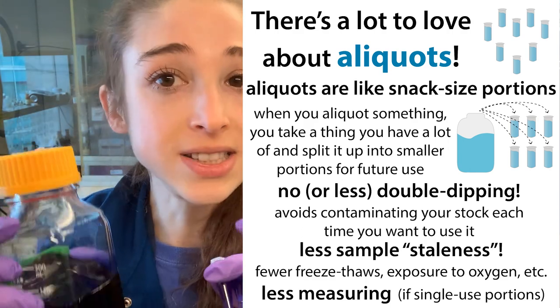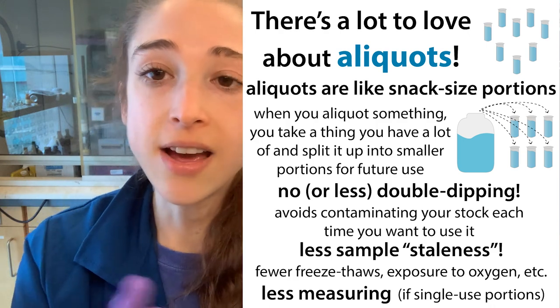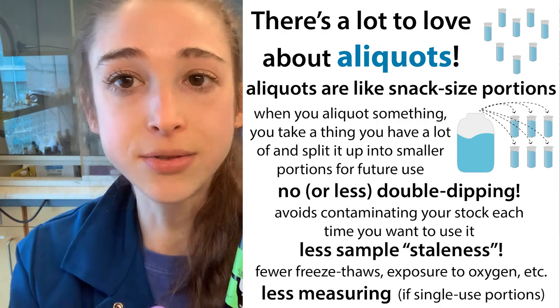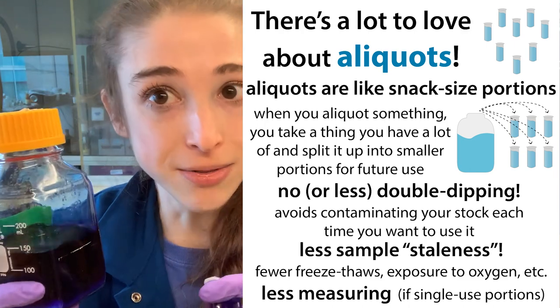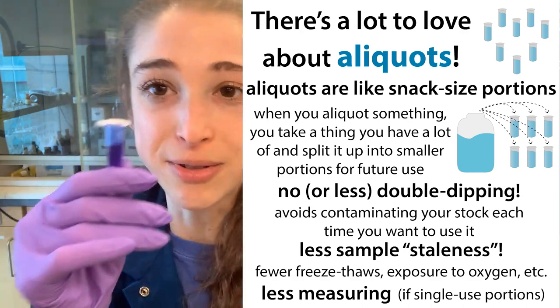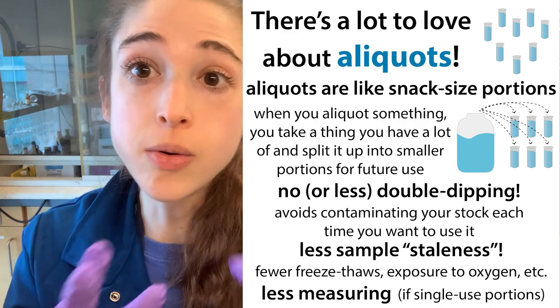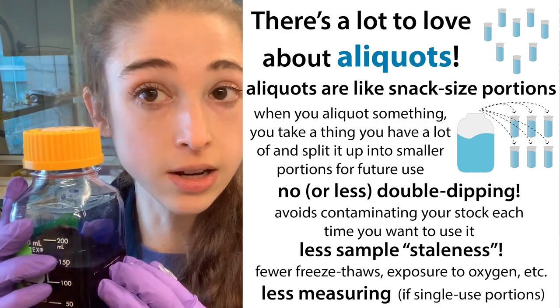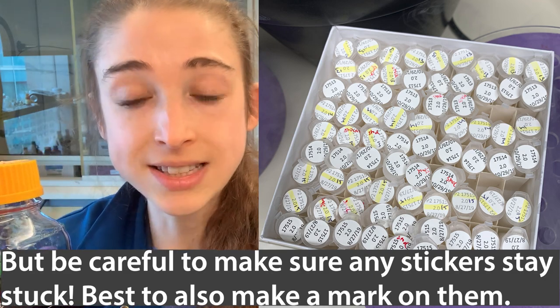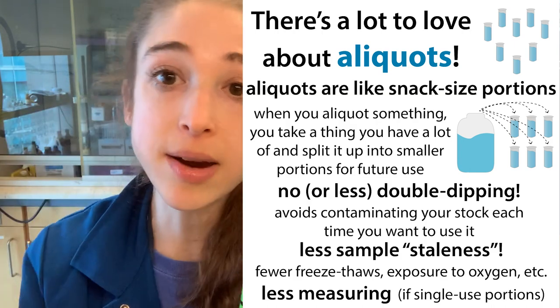Speaking of going back to the stock, let's talk about double dipping. Say you have a stock container — you spend all day making this big solution, and then you go to pipette some out and your pipette tip is dirty. Now you've contaminated your entire stock and you're going to have to remake the whole thing. If you had contaminated just a smaller aliquot, you can just get rid of that aliquot and use a new one. If you're having problems with one aliquot, you can try a different one or go back to your original stock. You should put dates on your aliquots so you know which stock they came from. If you're continuously going in and out of your stock, you're much more likely to contaminate it each time.